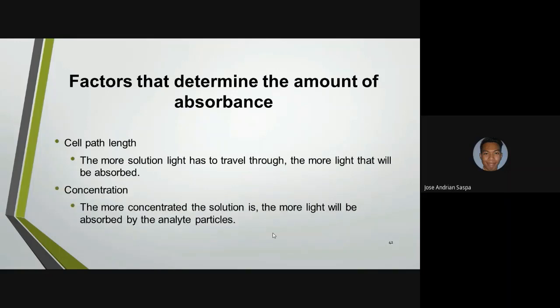And then in terms of concentration, the more concentrated the solution is, the more light will be absorbed by the analyte particles. So the darker the sample or the solution, the less light will pass through, or less light will be detected by the detector.